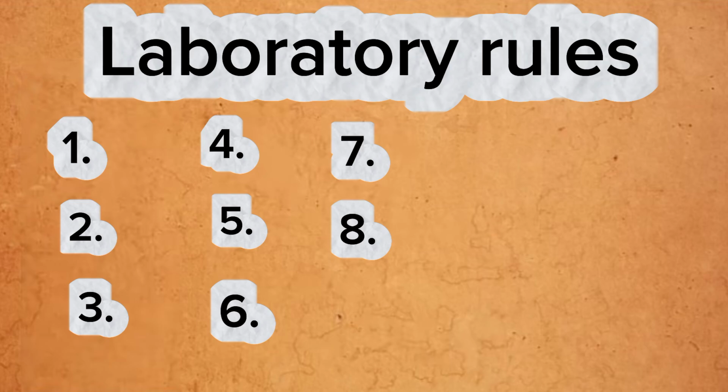Then number 9, do not interfere with someone else's experiment. Usiende kuharibia mwingine experiment yake. Kila mtu afuate rules kutengeneza experiment yake ama kuperform experiment yake. Yes, do not interfere with someone else's experiment.